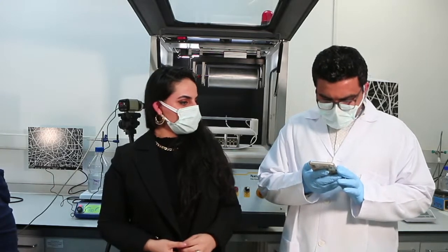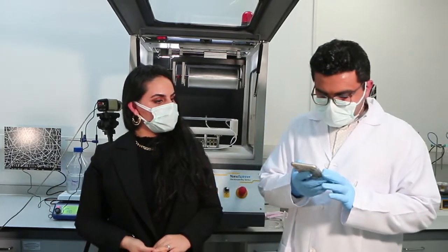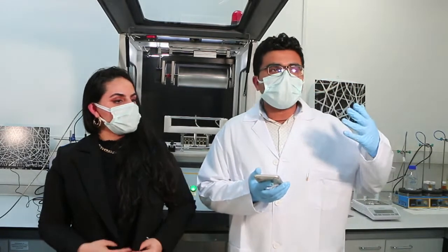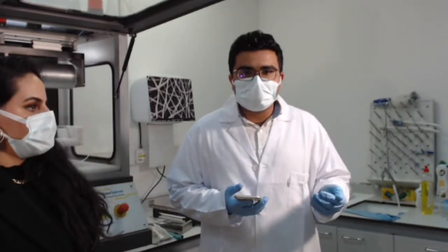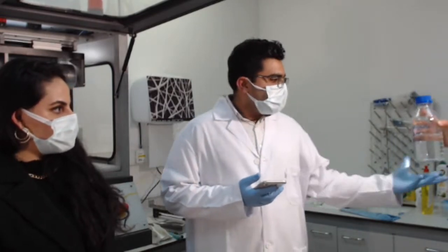Okay. All right. So Anthony Sabini actually has a good point. One has to consider the solutions are quite concentrated, so much solvent is not required at all. That's one of the key process measures you have to use with electrospinning. You're supposed to have trials with various concentrations, and you can find in the literature the types of solvents you can use, and the amount, like the weight percentage and all of that. So it's imperative even for us to conserve solvents. It's very important that you do your research.